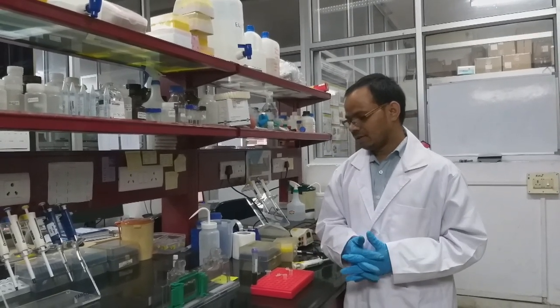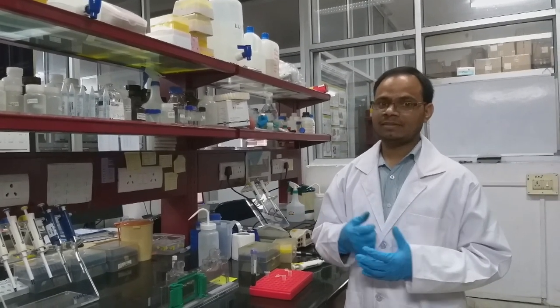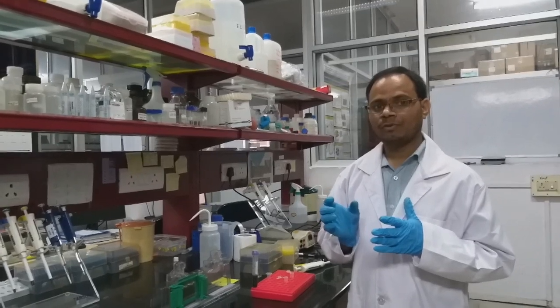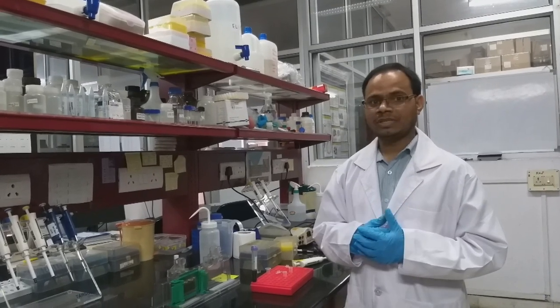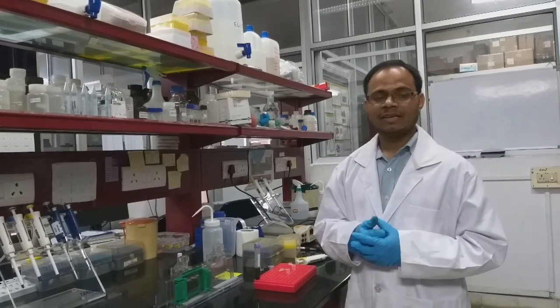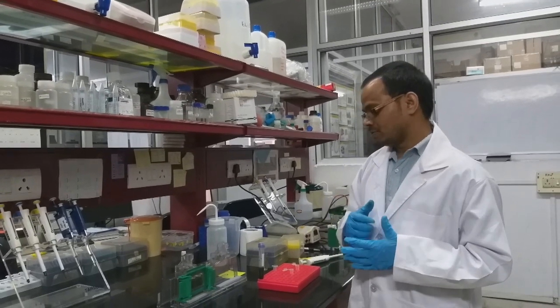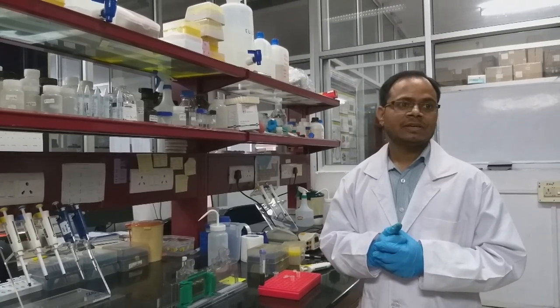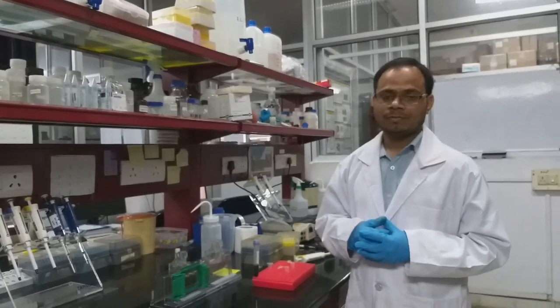The other thing is glycerol. While loading the gel, since the protein solution is not that dense, it may come out from the well. In order to prevent this, we load with a denser solution like glycerol. 30 to 50% glycerol is sufficient for keeping the protein solution intact at the bottom of the well. The other thing, bromophenol blue, we use just for tracking how much the gel has run. So this is the loading dye.